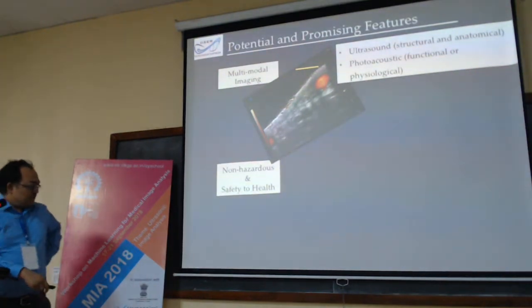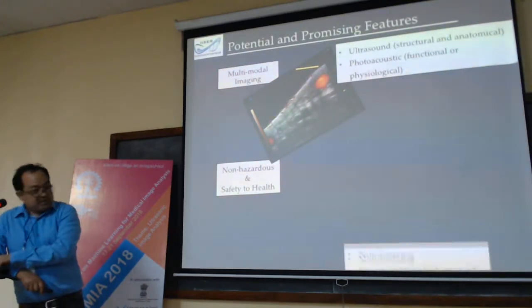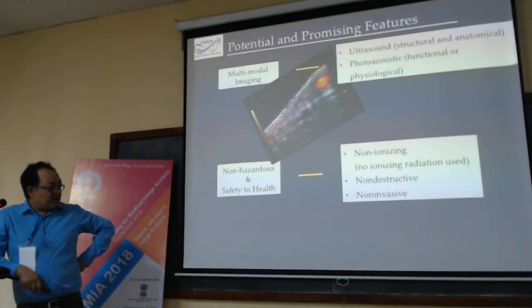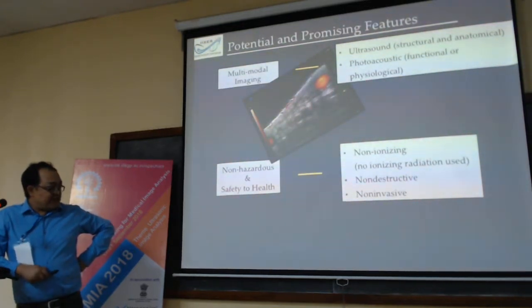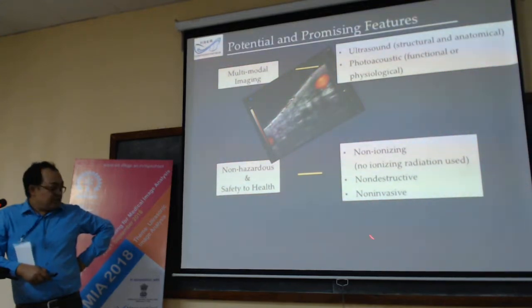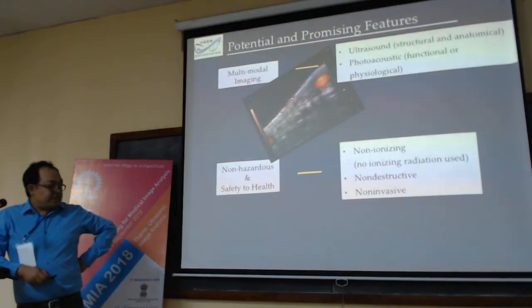Lastly, the imaging modality is non-hazardous and safe, because it doesn't use ionizing radiation, and it is non-destructive, so we don't need to cut the tissues, and it is non-invasive. We don't need to introduce any kind of drugs for improving the signal contrast.